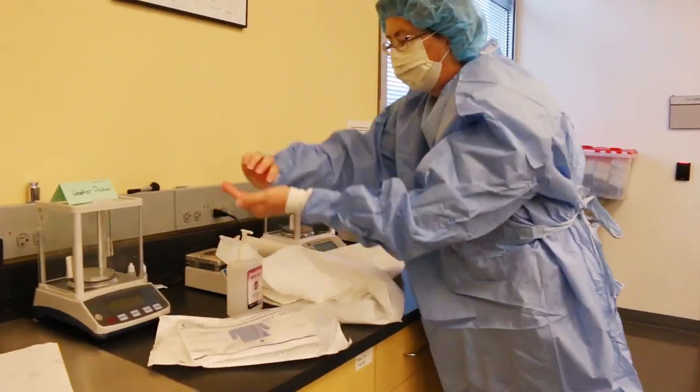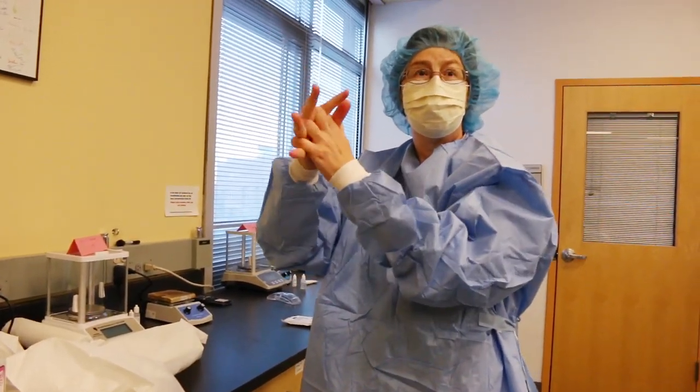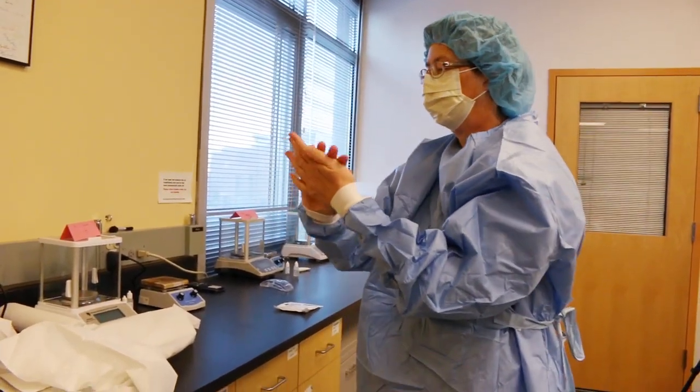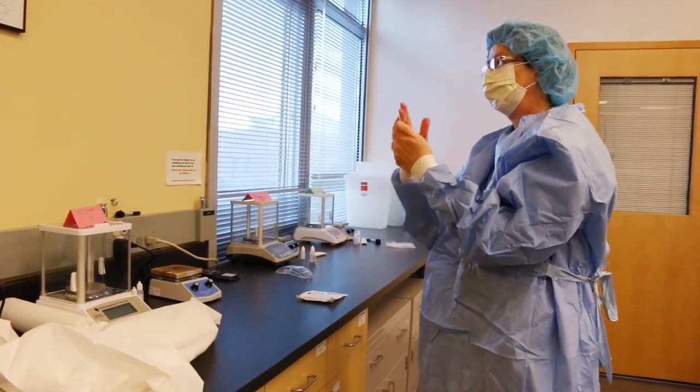The next step, which is labeled Step 24, is to sterilize your hands with sterile, foamed, 70% isopropyl alcohol.